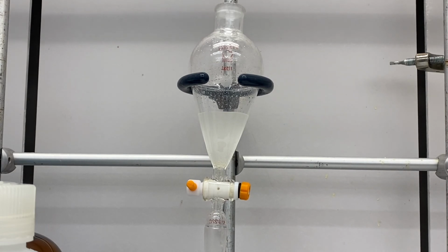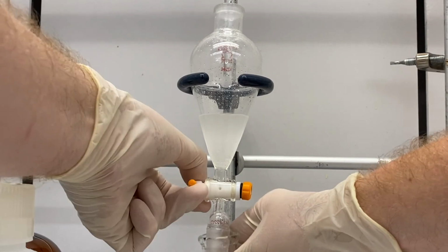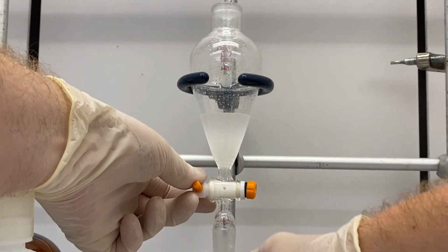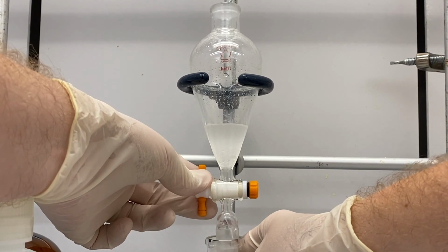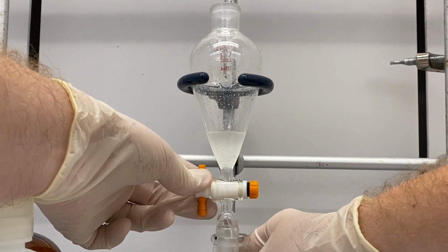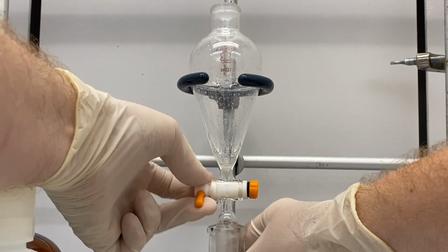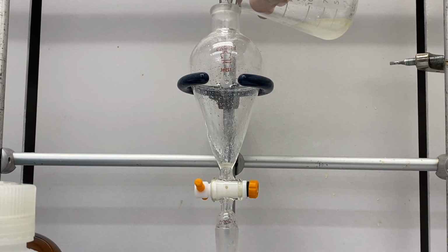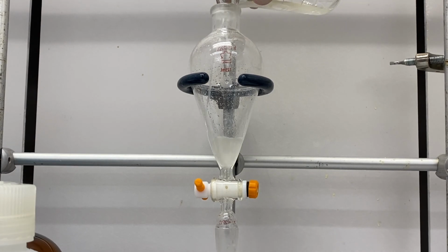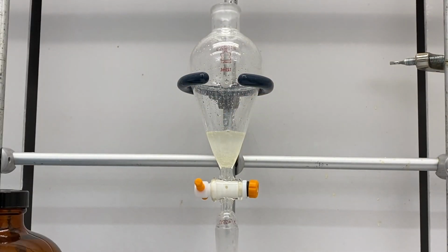Okay, now we've got a good layer at the bottom. We can drain that out. Drain out the aqueous layer, and then one more time, do the extraction. Again, 25 mLs of sodium bicarbonate.